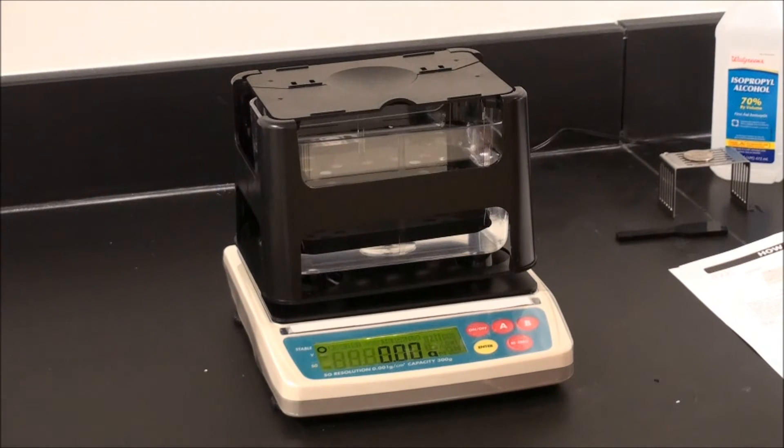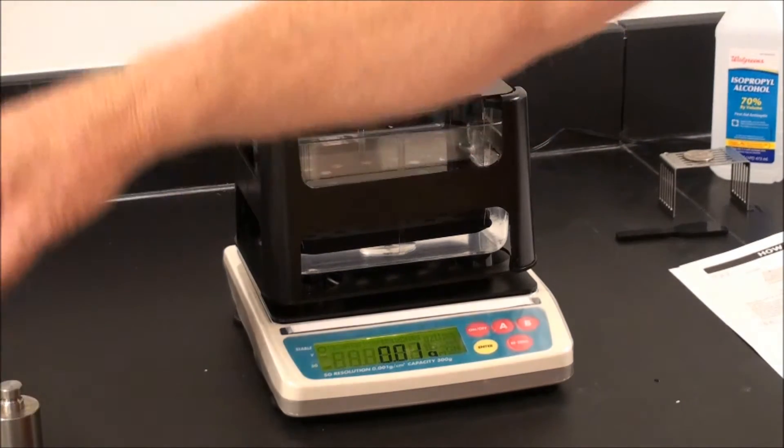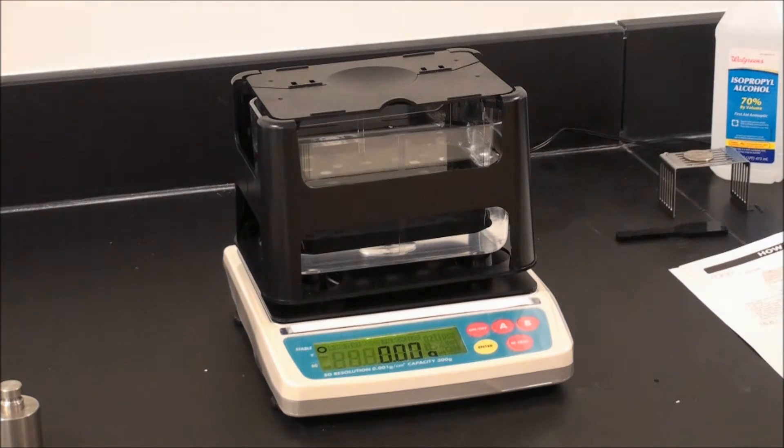You can check calibration by applying the weight. We should be plus or minus 0.01 grams. Remove the weight. We're now ready for operation.